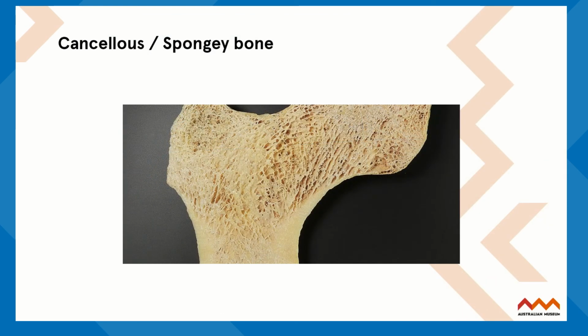So you might be familiar with spongy or cancellous bone, which is like a honeycomb structure inside bones. The role of the adhesive consolidation is clearly demonstrated here, where it fills those honeycomb structures to support the bone. Imagine the open spaces in this image of bone being filled with an adhesive. Once that dries, that part of the bone would be much more solid and stronger. This allows the researchers to handle bones and study them without breaking them or having them cave in.